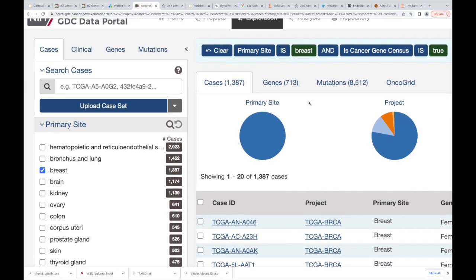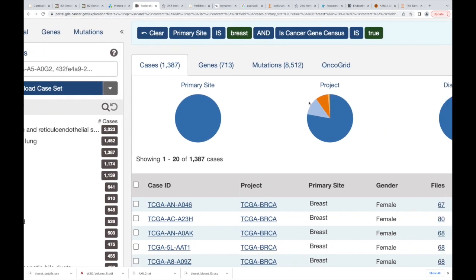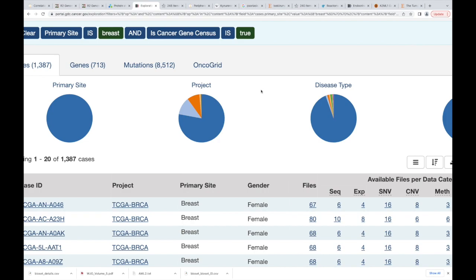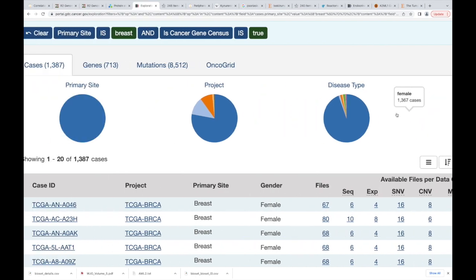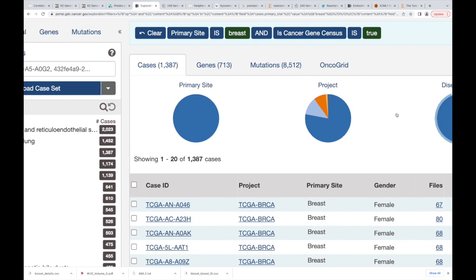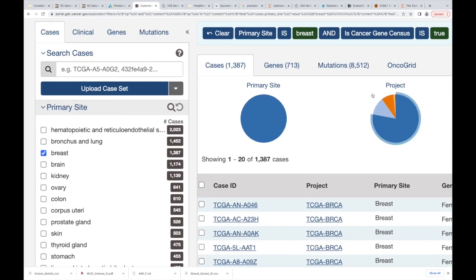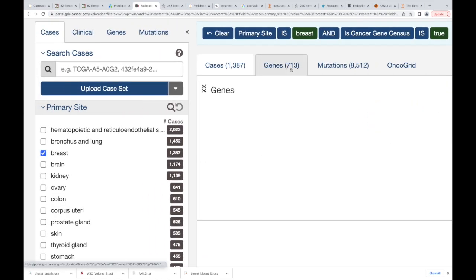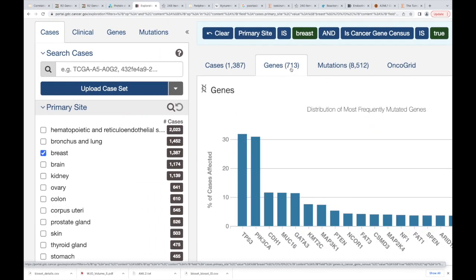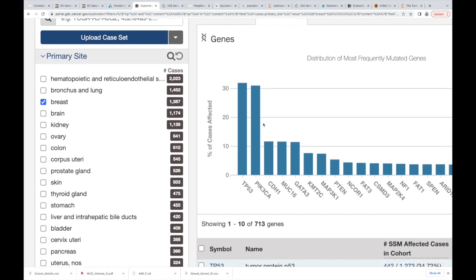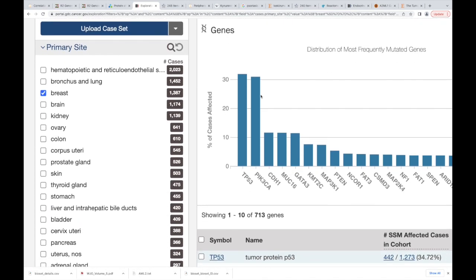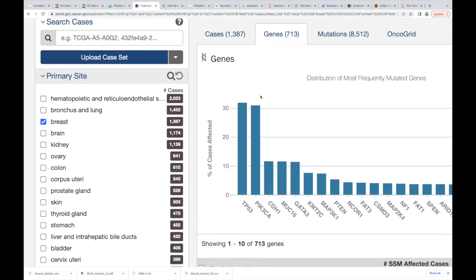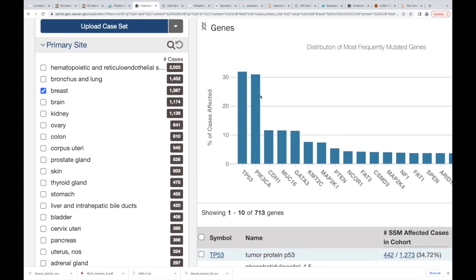As you do that, your primary sites, project, disease types, they all change a little bit. We can also now go to genes itself.